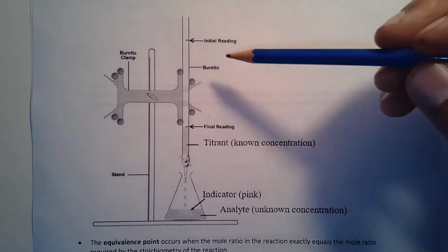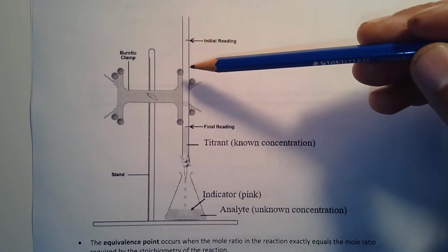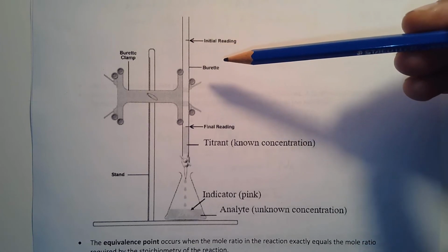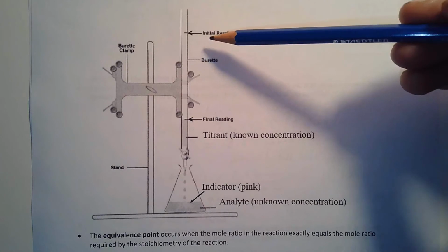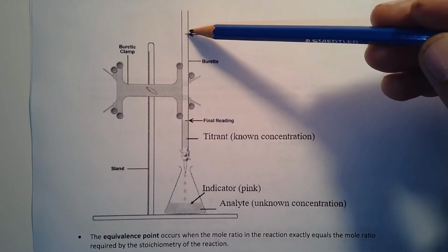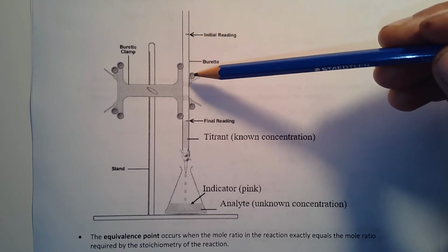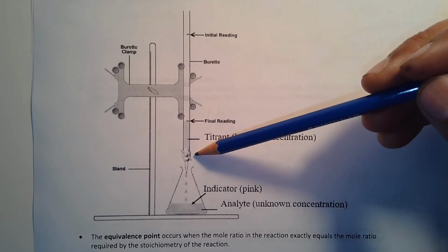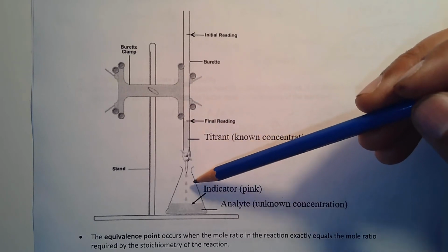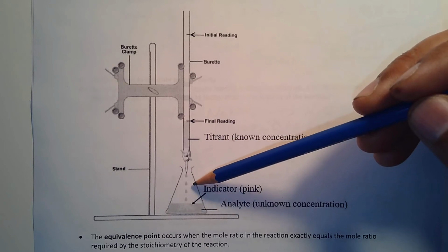Okay, so this is a burette. A burette is used in analytical procedures. It's all marked with volume. At the bottom, you have a valve, which basically controls how much flow you're going to get coming out of the burette.